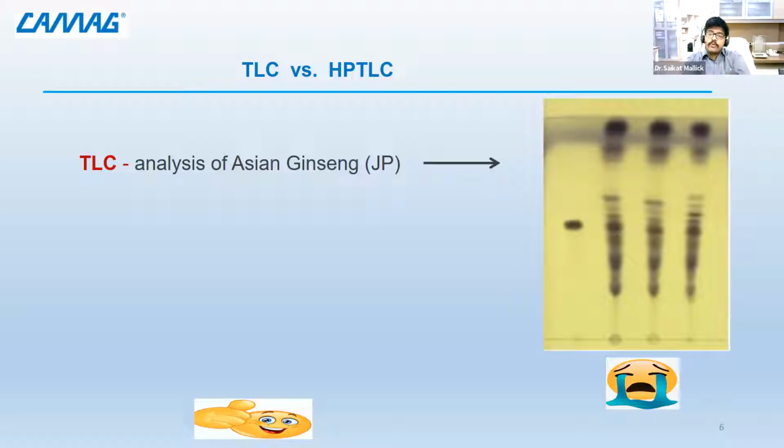In fact, if you see some older books of chromatography, like Thin Layer Chromatography by Egon Stahl, a very good book on TLC, it shows how they did different analyses of sugars, lipids, and so many different types of complex problems solved with thin layer chromatography. In it they have marked the plate with where the RF positions you will see, a virtual plate or handmade drawings, like we used to do in our 11th and 12th journals. You have seen we used to draw the plate and mark where the spots have come. And so it became very unreliable, because it depends upon the analyst who is doing it. He needs to have some skill.